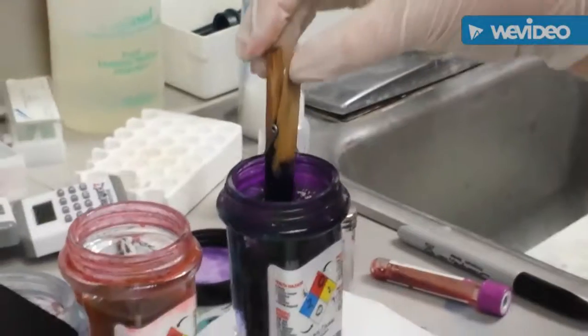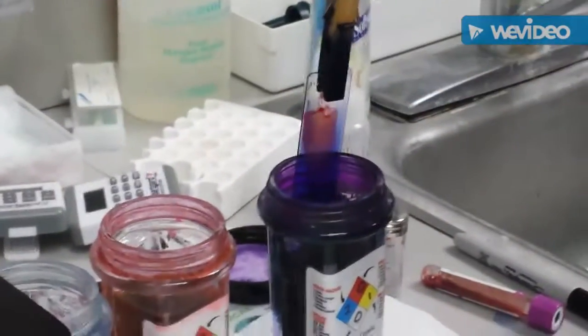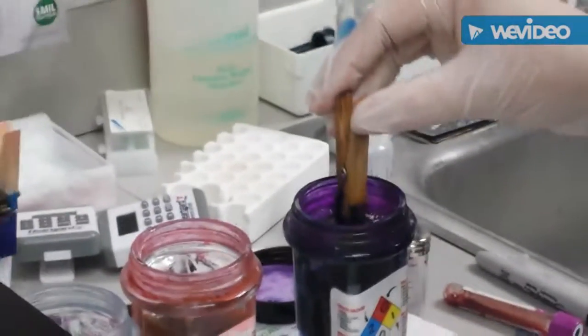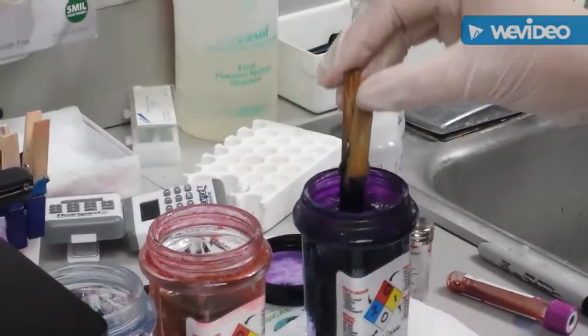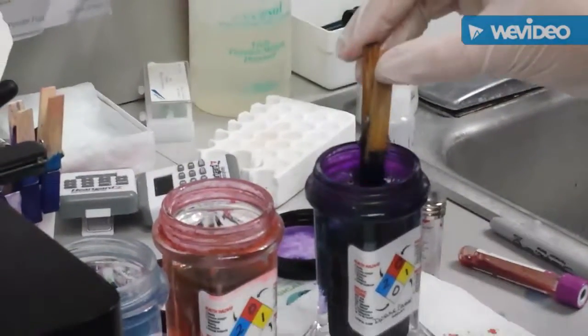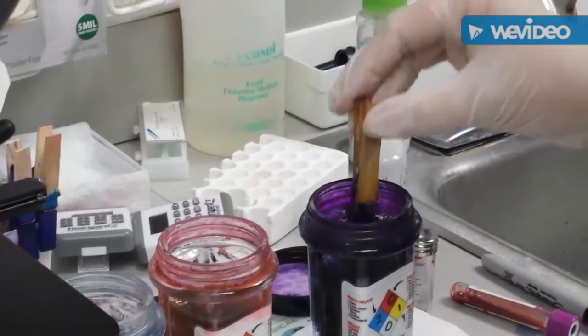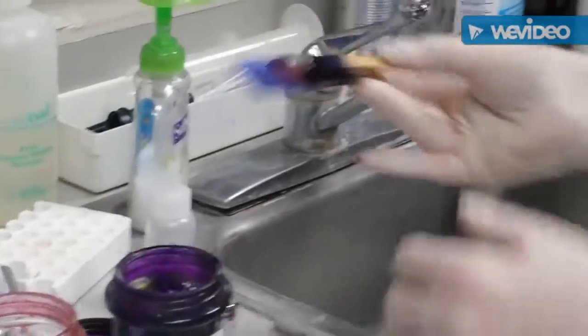And then our final stain. Okay, and then we're going to go ahead and rinse this one off too.